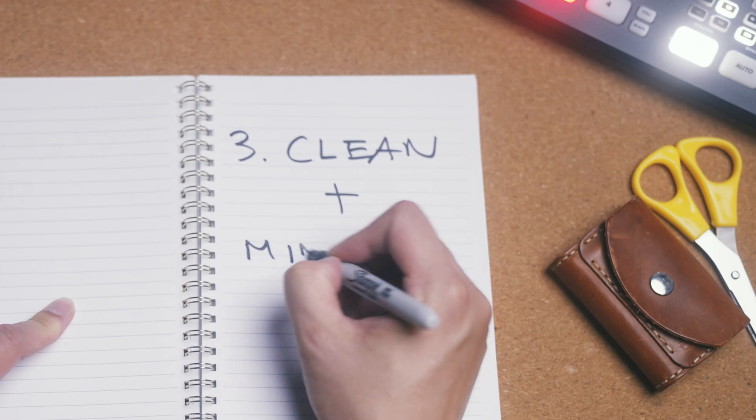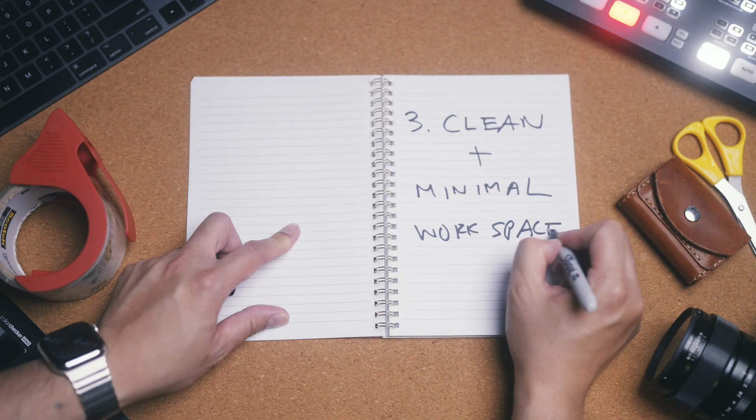Third, keep your working space clean and minimal to lower the chance of accidentally bumping your samples or touching your pipette against another surface. Only bring things into the hood that you need for the experiment, and try to break the experiment into stages with only the equipment you need for each stage in the hood at any one time.